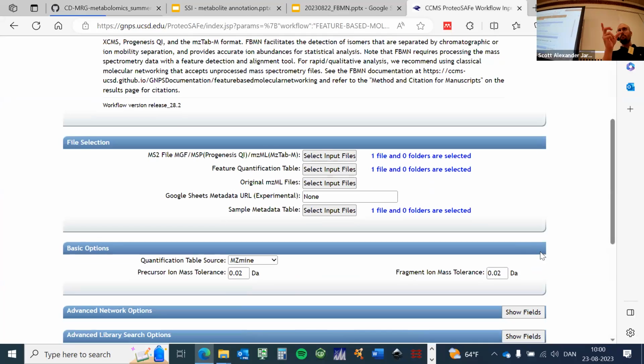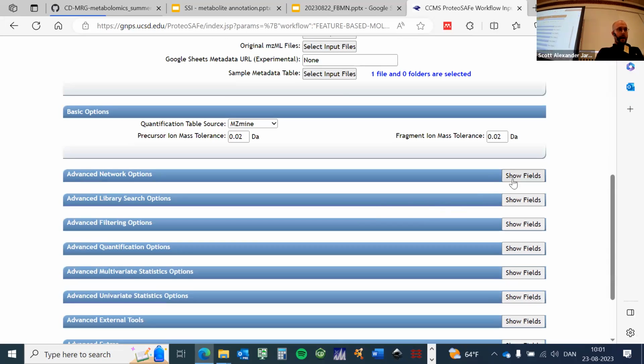So someone pointed out, you have your files here. You should have 4 files uploaded. Your metadata one doesn't appear here. It's just because there's not a prompt for it. But if you've uploaded it into the input screen, it's there. And then these other fields, we don't have to play with.